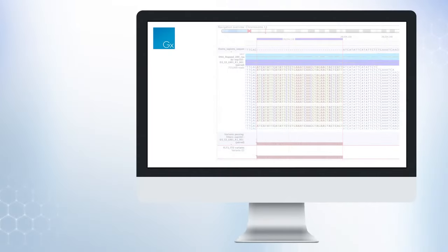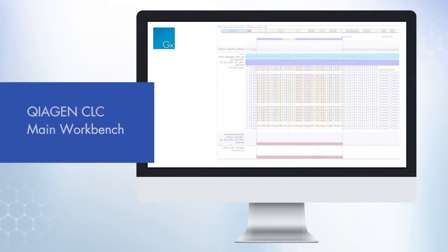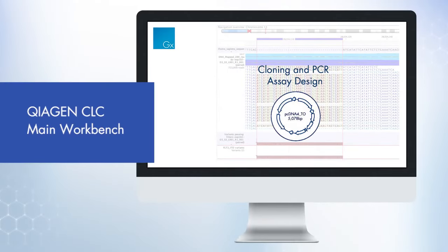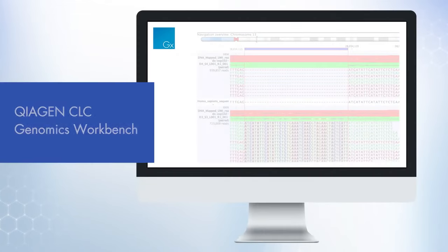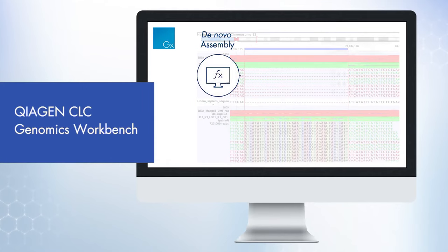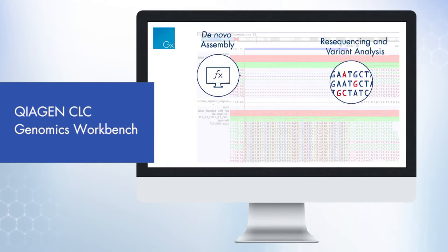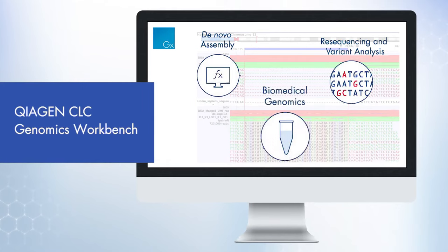The CLC Main Workbench is perfect for those essential tasks like primer design, whole genome alignment, or phylogenetic analysis. Or you can upgrade to the CLC Genomics Workbench, which is perfect for de novo assembly, resequencing, gene expression, or biomedical NGS data analysis.